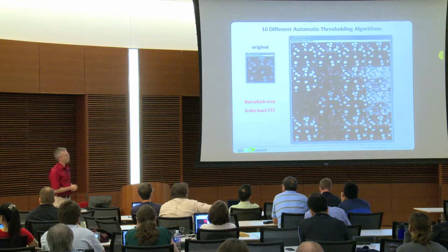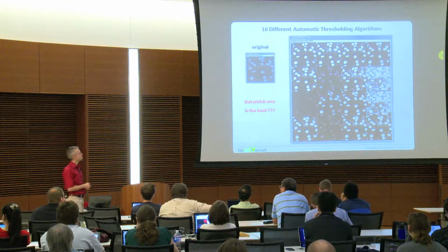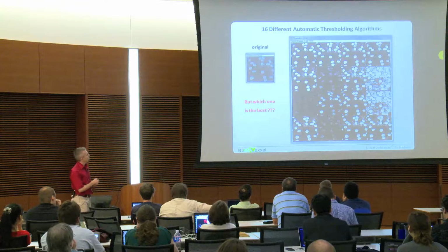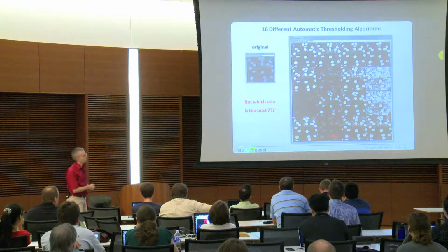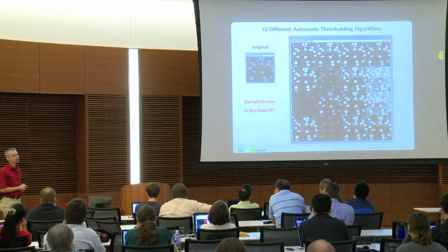And then the question comes up, which one is best? And that is already, again, a little bit troublesome. Here it's clear these two are not so good. For some of the other ones, they are very, very similar. So we need to have a kind of decision making here.